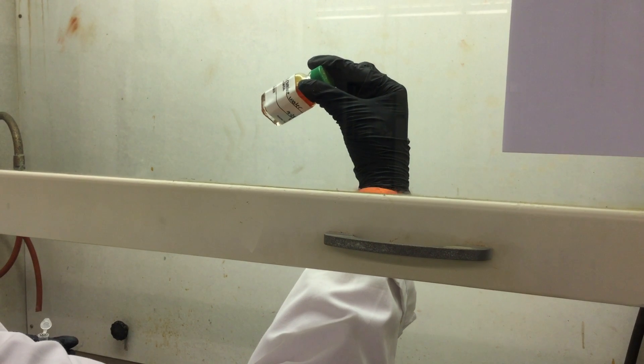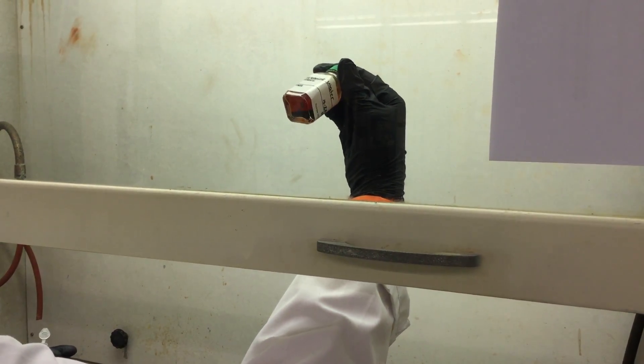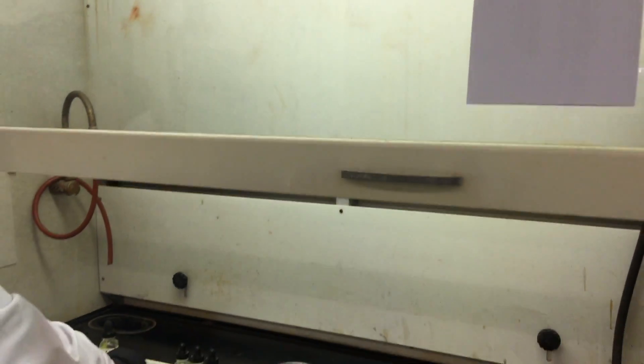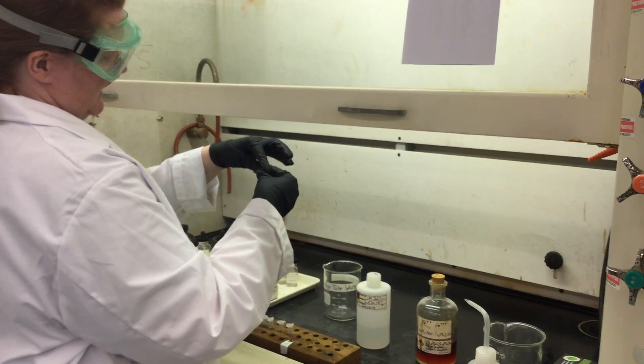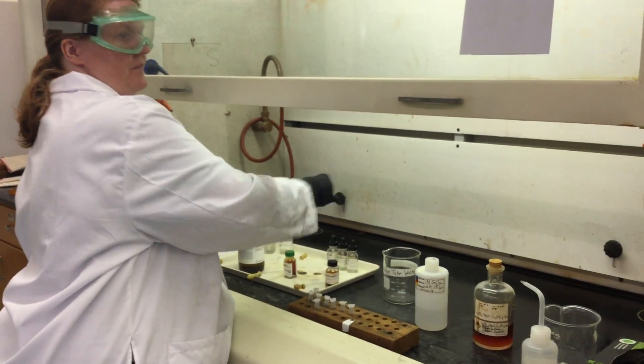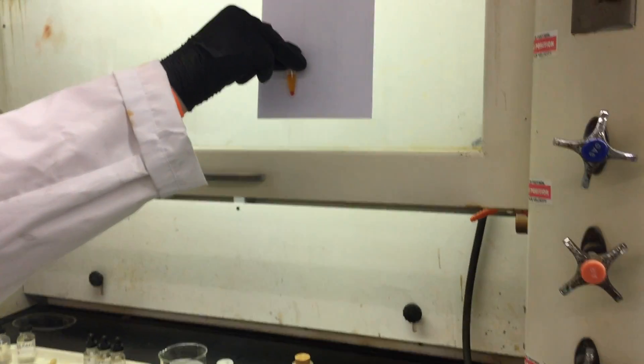So I've put a little bit of bromine in the aqueous layer, and I'm going to mix them. Again, we're looking at the bottom, we're looking at the organic layer, so you want to make an observation about what color that looks like.